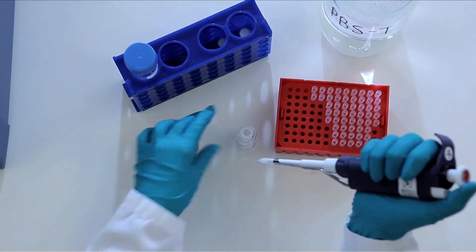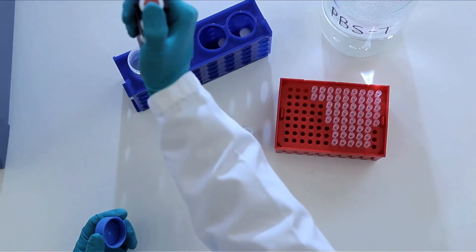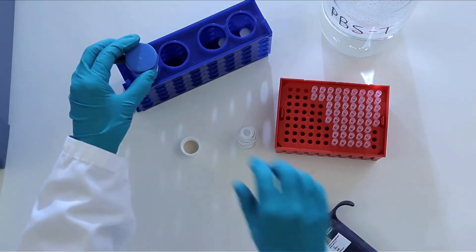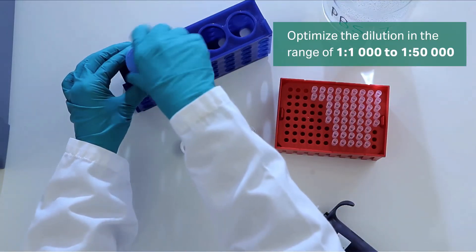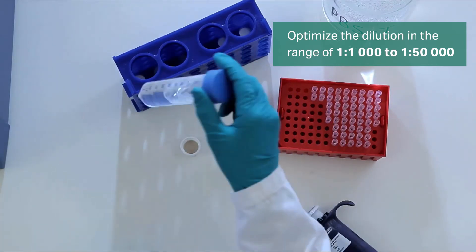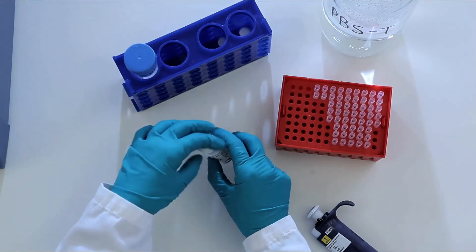Dilute your primary antibody with PBST. If working with phosphorylated proteins, you must use TBST. Always use high quality antibodies and optimize the dilution in the range of 1 to 1,000 to 1 to 50,000. Using ECL Prime keeps precious primary antibody use to a minimum.